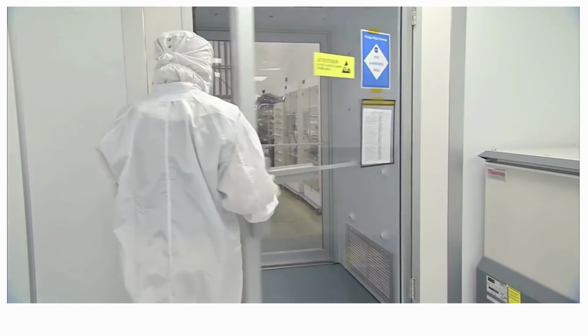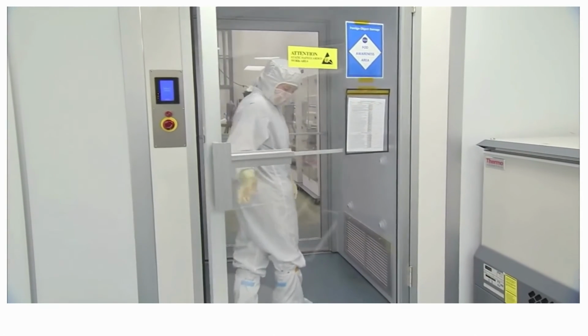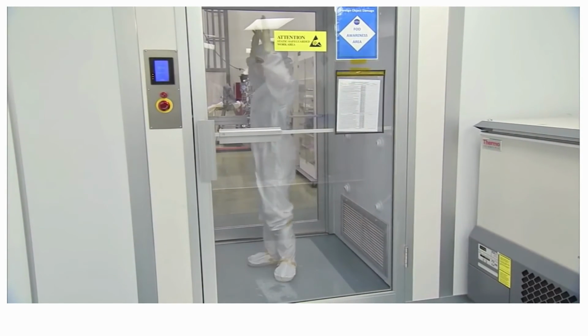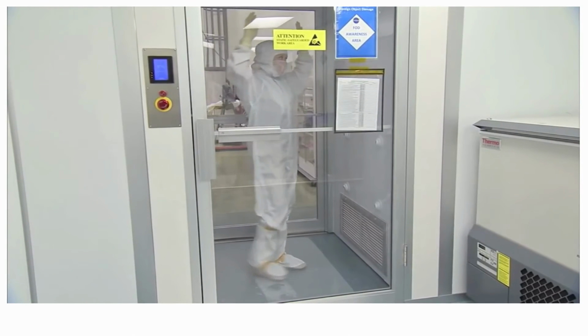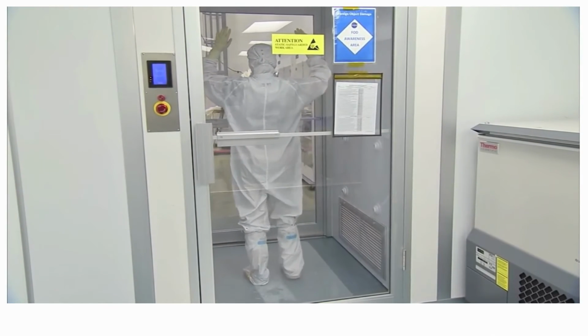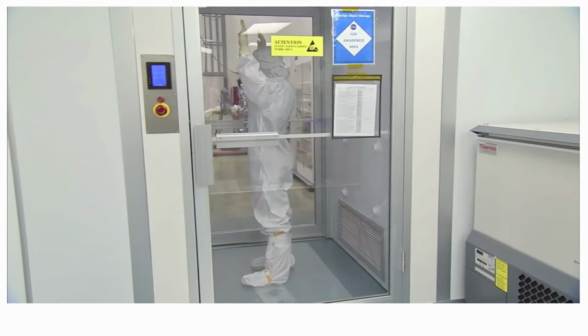If your cleanroom has an air shower, be sure to use it prior to entering the cleanroom. This shower blows pressurized air over the garments, as a final cleaning method to remove particles before one enters the cleanroom. Only one person at a time may use the air shower.